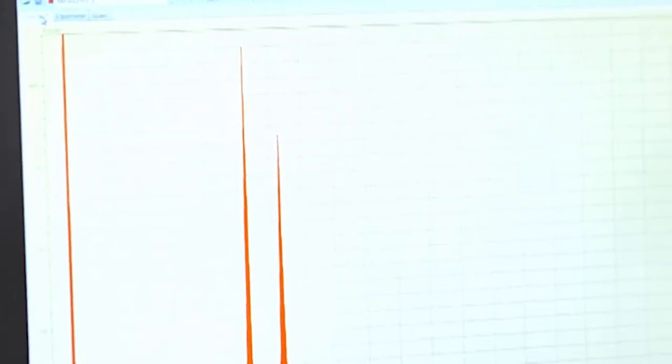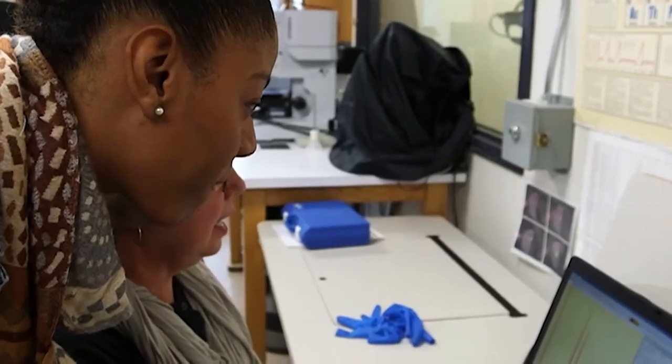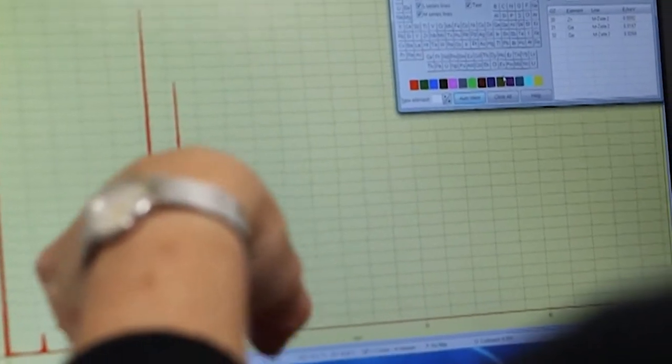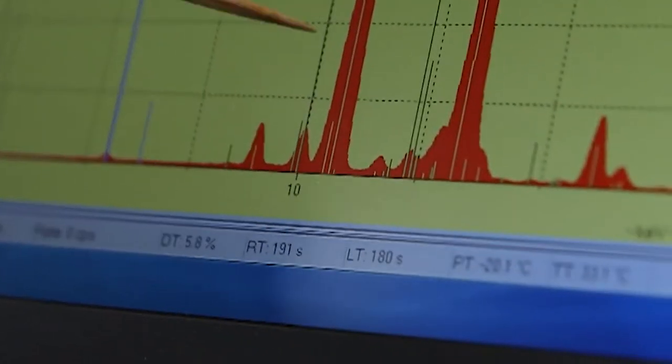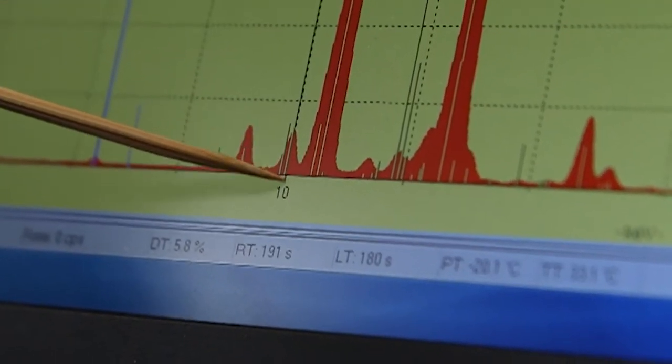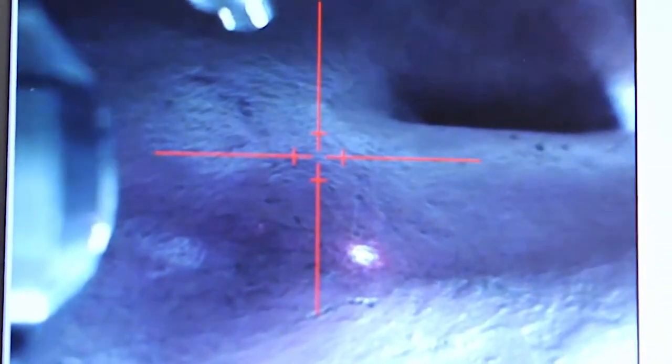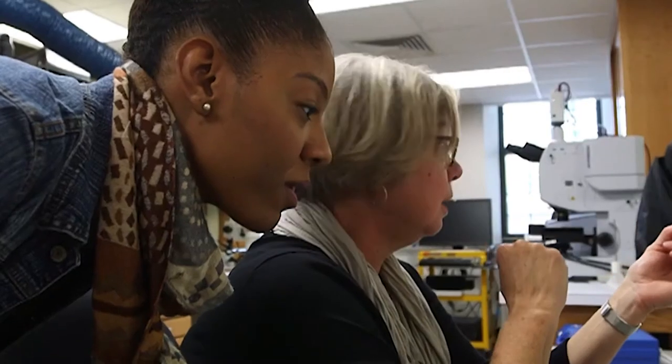How many times do you do this? In the case of this particular sculpture, I took more than 20 spectra from various locations on the sculpture of St. Francis. We're looking at St. Francis's knuckle, trying to figure out which pigments are present. When I see this sort of pattern here, they indicate the presence of lead. But then there's this one — very close to the lead peaks but very distinctive — indicating the presence of mercury. This is primarily lead white with the presence of mercury to give it that pinkish hue. The mercuric sulfide red would have been mixed with lead white to create the pink surface of his knuckle.